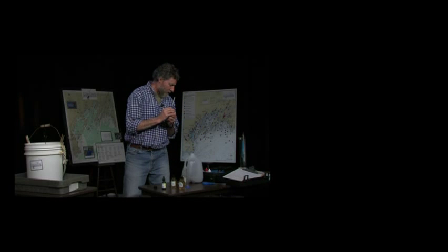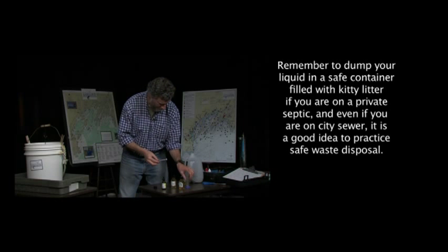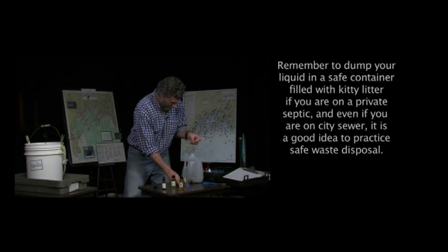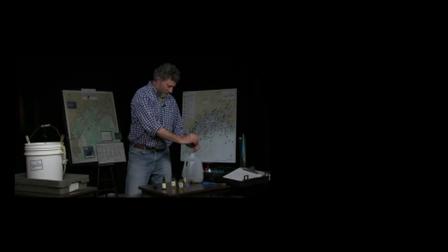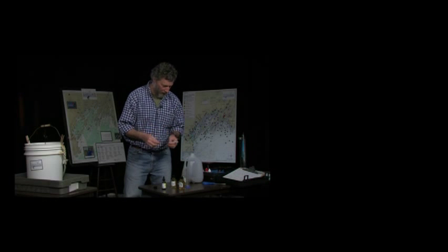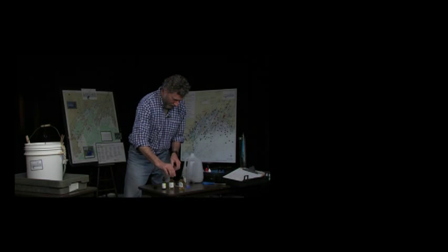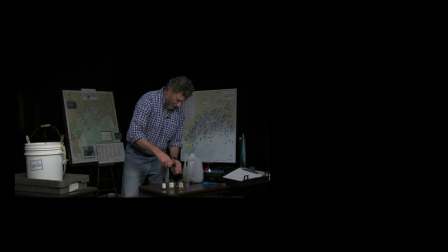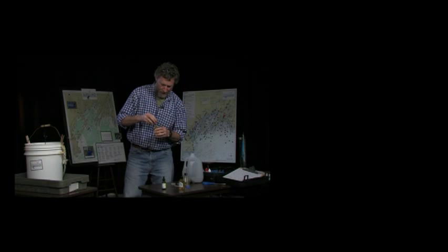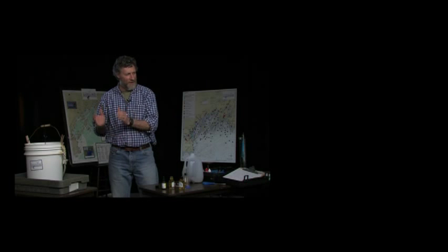And we will get rid of this. We'll set this aside. Any thiosulfate that you have left over in your syringe, you can discard as well. We don't want to reintroduce that thiosulfate back into the bottle when we fill it up again for our next test. Our next test is bottle number 2. And we're going to do the same process with bottle number 2. And we're going to hope that the results for bottle number 2 are going to be in line with bottle number 1.